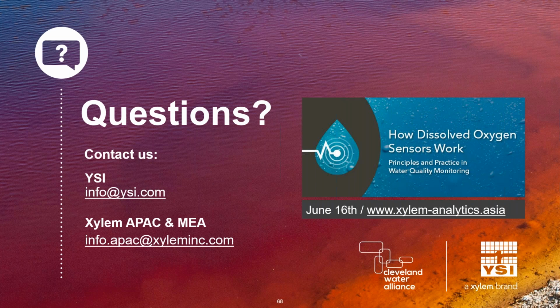If you're in a lab, you want to calibrate it every day. If you're going out into the field, you probably want to calibrate it every day. When it's brand new, you may be able to get away with every few days or maybe every week. If you really want to be sure, you can always put it back into calibration solutions and see what it reads. If you're worried that your pH probe has drifted, just stick it in some pH 10 buffer or what have you, pH 4 buffer, and see how close it reads to that. If it's significantly off, just recalibrate.